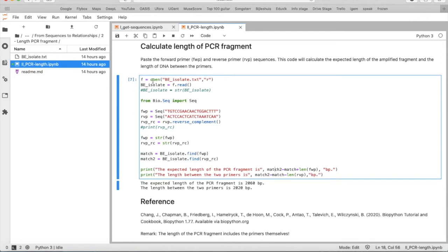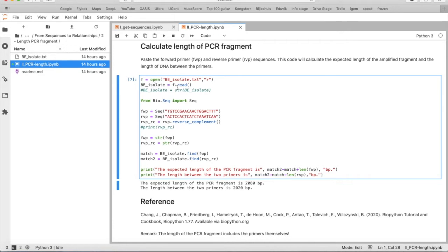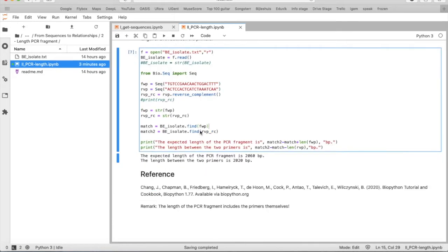So we say F is open, the file name, and then R for read. And then we say, okay, we want to extract only the text information of that F object, so we say BEIsolate is F.read.